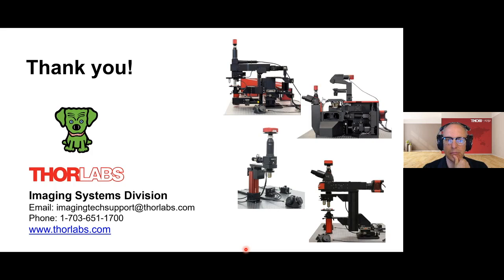Okay. Then going back to lasers, you said that fast high peak power lasers are needed for confocal. What are the pulse width and energies needed in the lasers that are used? Those pulsed lasers are needed for multiphoton. I'm sorry if I spoke wrong during the talk. Multiphoton imaging needs pulsed lasers in order to achieve the high peak energy needed for multiphoton imaging.